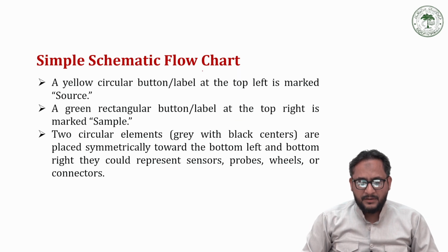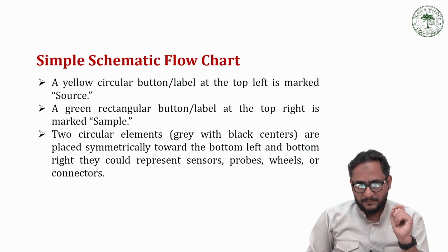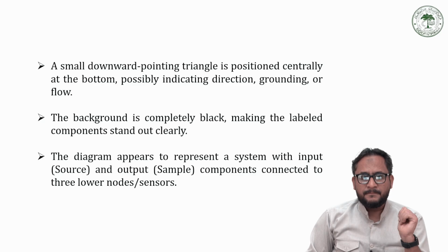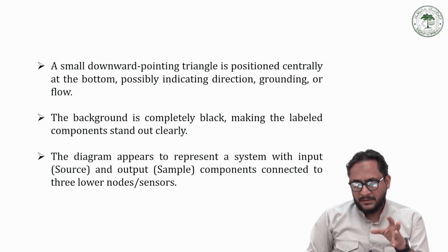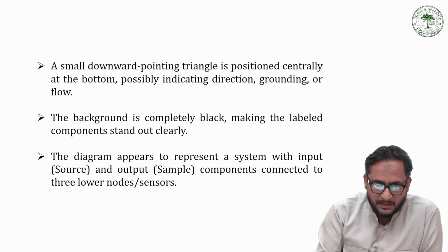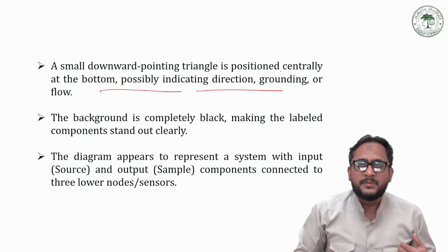Then we again have a monochromator which selects some light radiations of our interest while excluding the others. Then these light radiations fall on the detector, which is a photomultiplier tube. The signal of the photomultiplier tube is amplified.